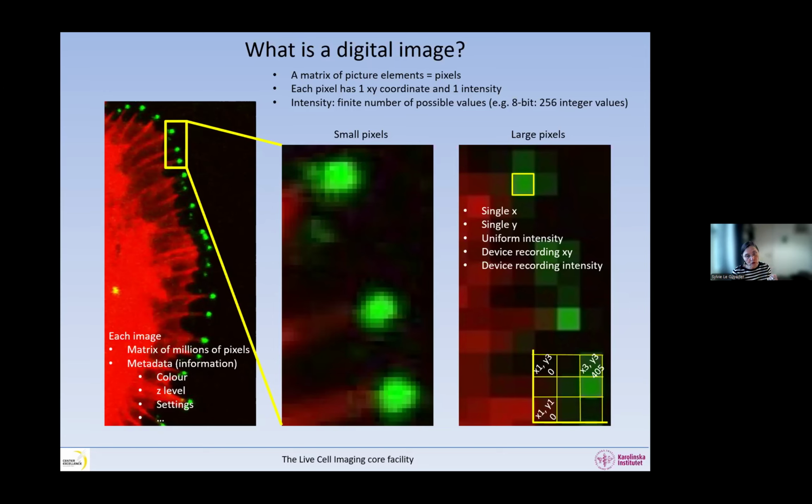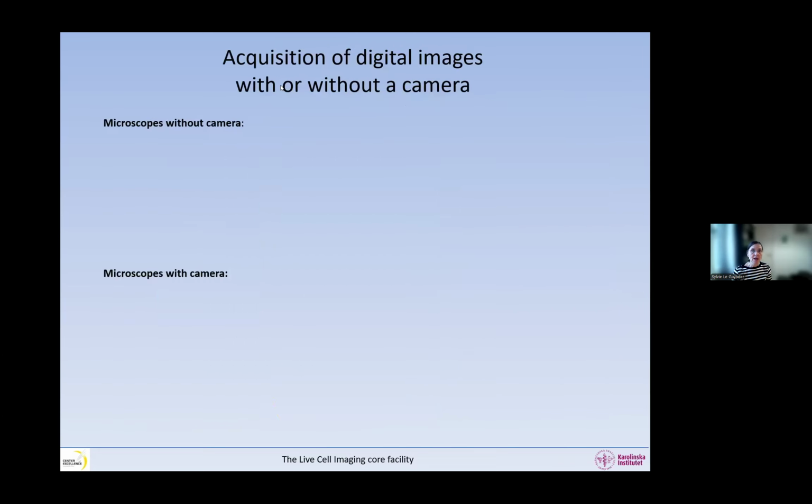When you go to your microscope and open an image, on many microscopes you are able to push some sort of reuse button that sets the microscope again exactly the same way you had it when you acquired that image. This is because the microscope reads the metadata and applies all these settings to the microscope. So the metadata is very important, and it's important that it's preserved in the image. It's embedded in the file, so it's a single file. Most of the time, you have only one file.